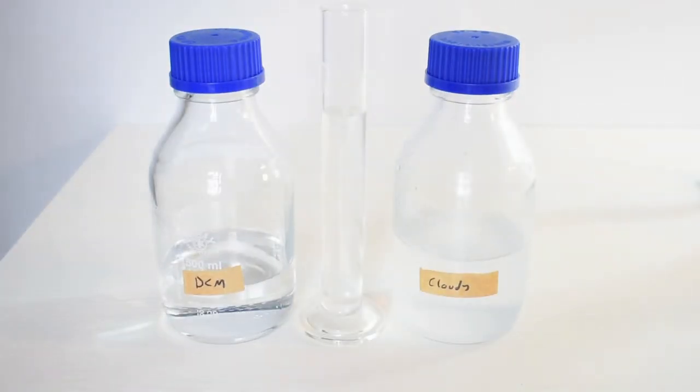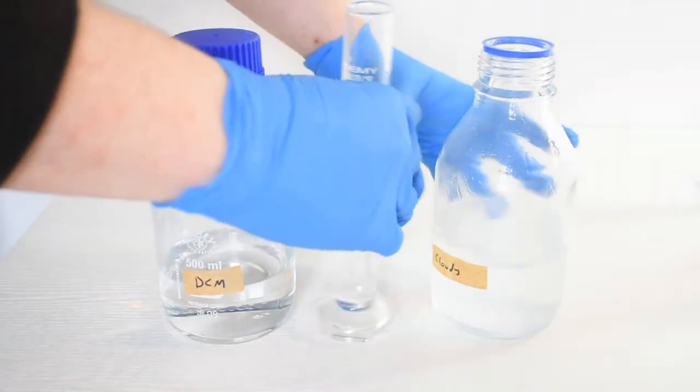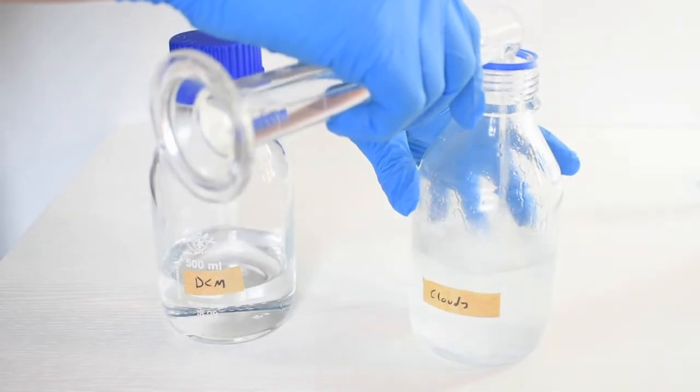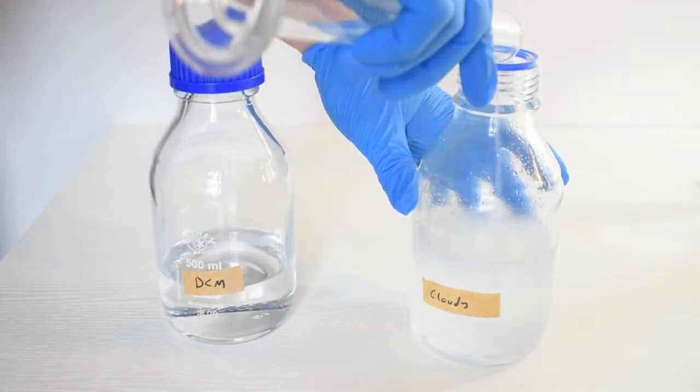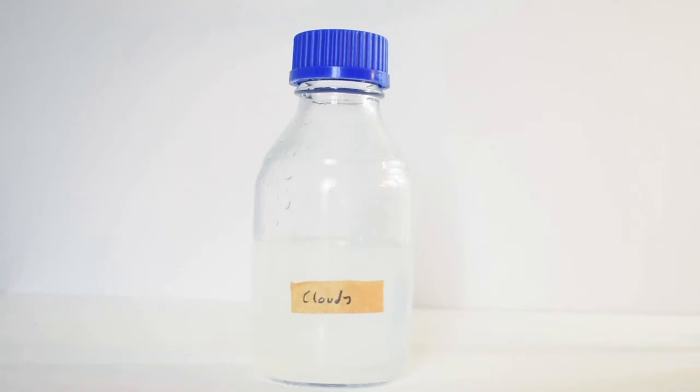The solvent which is going to be used to extract the mint oil and the menthol is called dichloromethane. So first, about 50 milliliters of dichloromethane is added to the bottle of cloudy distillate. Dichloromethane is significantly more dense than water, so it forms a layer on the bottom. To get everything to dissolve, I'm going to take the bottle and just shake it up.